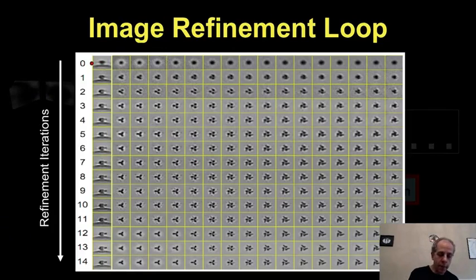You start from, this is kind of the very beginning, nothing looks okay. If you average things which are completely non-aligned, you just get balls. It's just everything going in every direction. Then things start getting better.